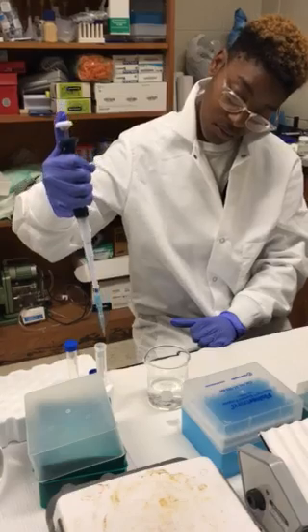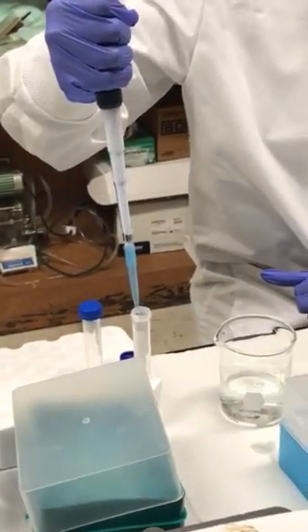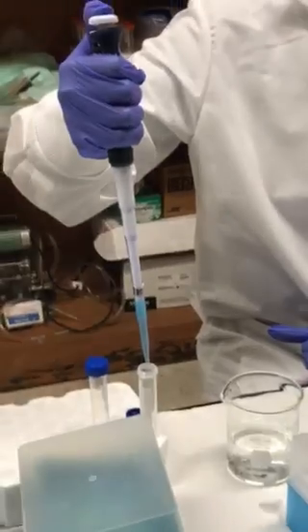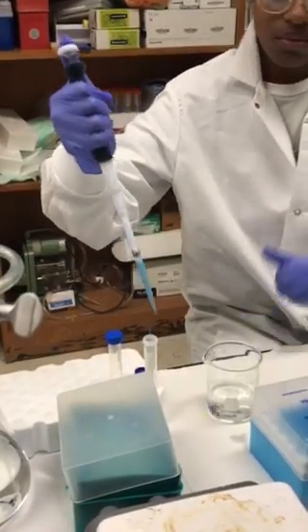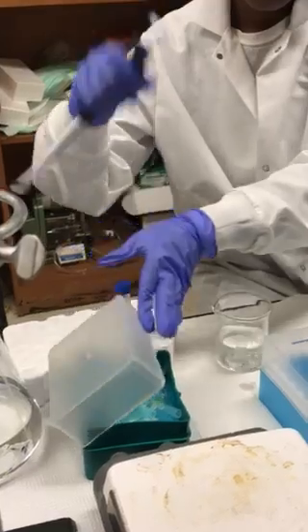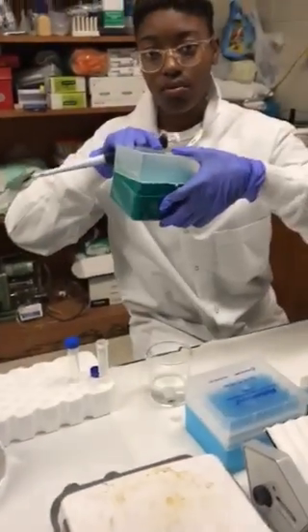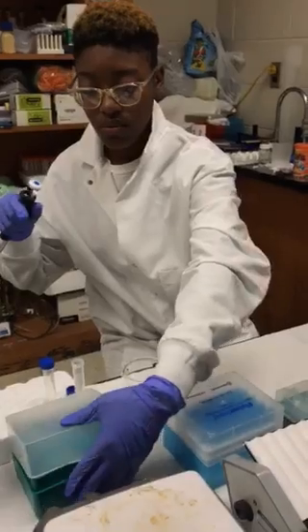Pressing the plunger down to the second stop releases all liquid from the tip. Pushing the tip ejector releases the tip. Make sure you put the tip into a waste beaker or container after use. Never reuse the same tip when dealing with different solutions.